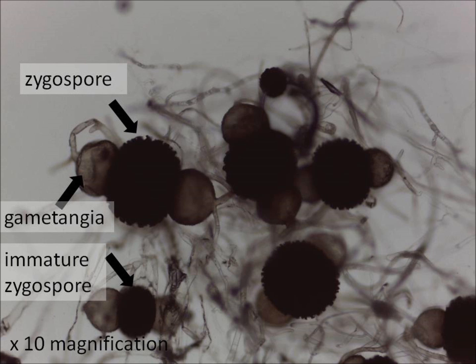You should also be able to see an immature example of the zygospore here.